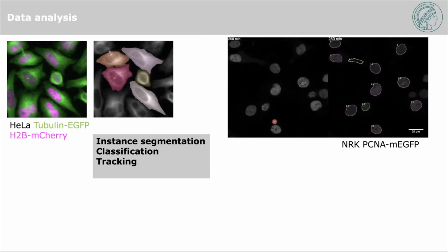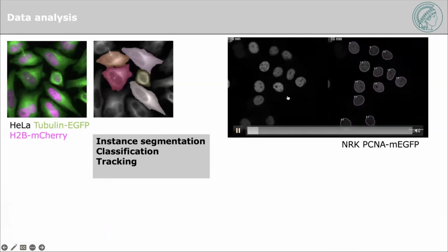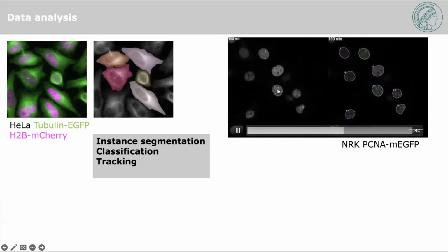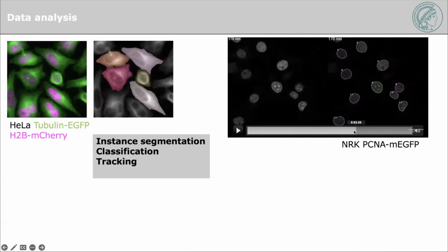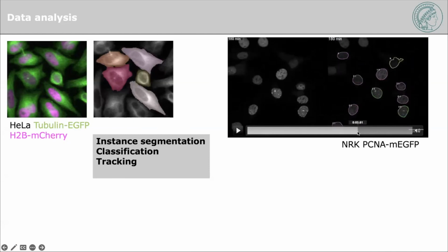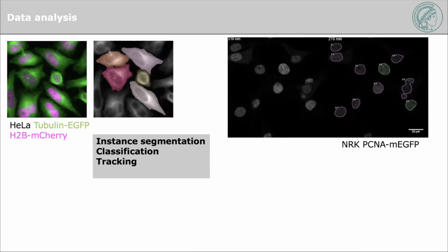So all the other cells are running around it and moving around it, but the microscope is basically keeping this cell in the middle, because we want to see when it changes state from this classification, where we classify the S phase with this marker. And then when all these little dots go away, we go to a G2 state. We were interested in this case to identify exactly this time, then wait for 2 hours and then start the imaging. So it was a very ad hoc experiment for a certain project where we needed a little bit of tracking, segmentation, and classification on top of it.